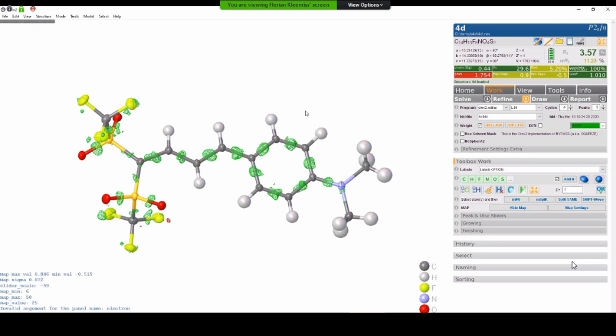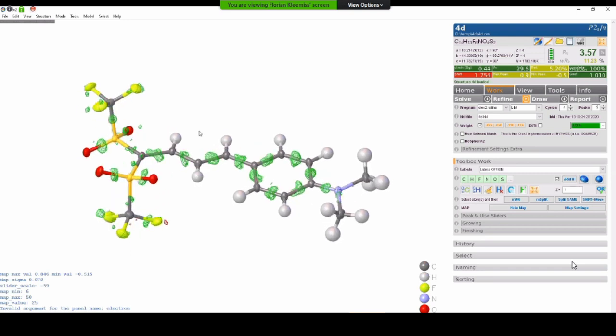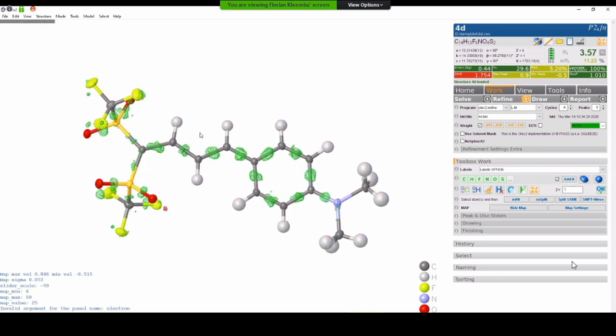What we do is we use the Hirshfeld partitioning, which just asks how big is the contribution of the atom that I'm looking at to the whole molecular density from the wave function. Using this cutout criterion, we multiply the density of the wave function with this weighting scheme for each individual atom, and then we can cut out atoms in a fuzzy way.